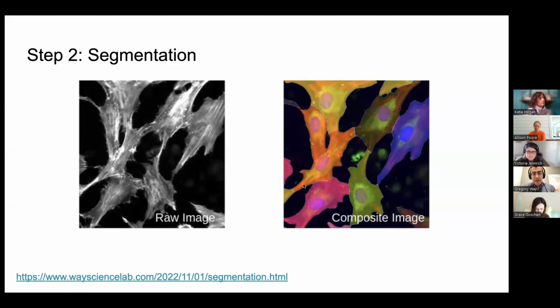For instance, we can apply a segmentation algorithm, and it might tell us that this right here is the boundary between this cell and this cell. But it could have just as easily made the boundary a micrometer higher. Sometimes it's obvious, sometimes it's not. And we have procedures to evaluate how well segmentation is performing.